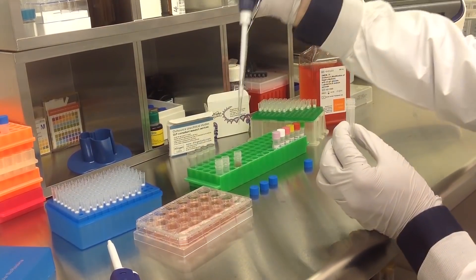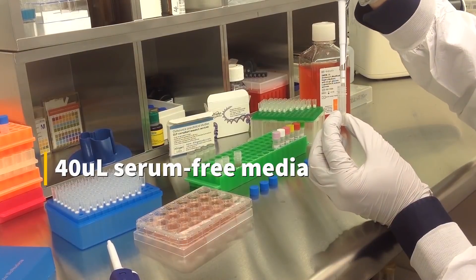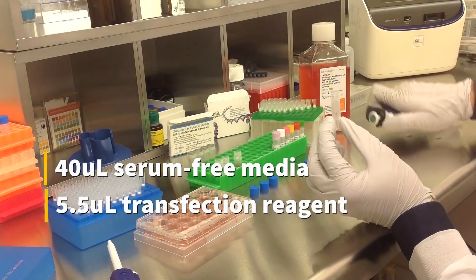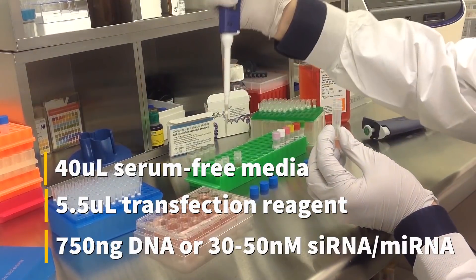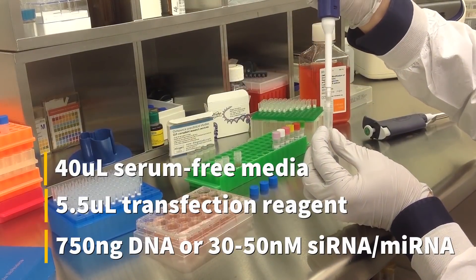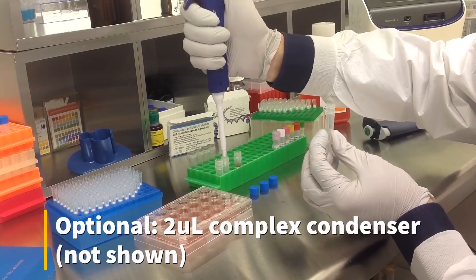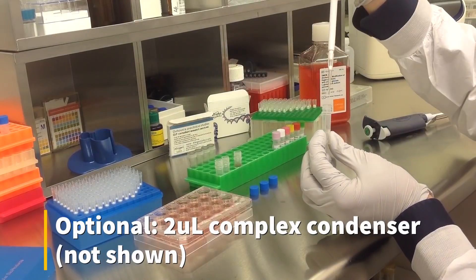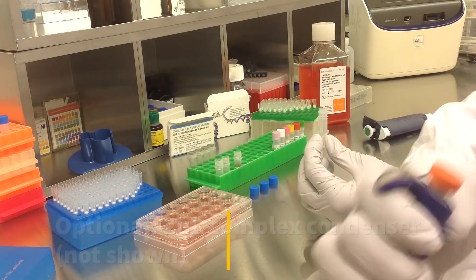To prepare the transfection complex, mix 40 microliters of serum-free medium, 5.5 microliters of transfection reagent, and either 750 nanograms of DNA or 30-50 nanomolar sRNA or microRNA. An optional step is to add 2 microliters of complex condenser, which increases transfection efficiency but may also increase cytotoxicity.